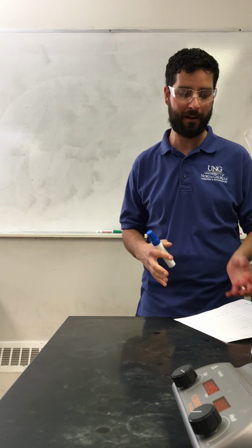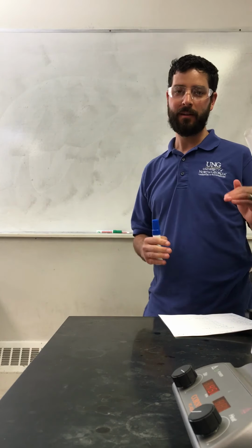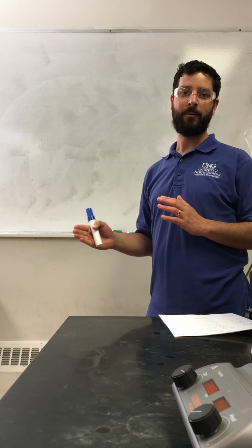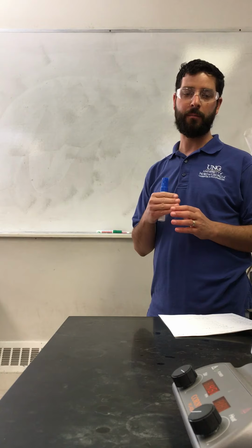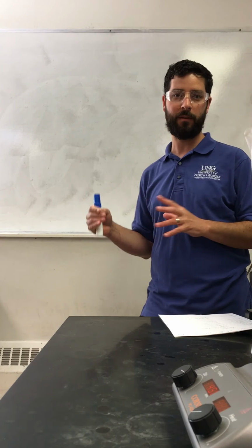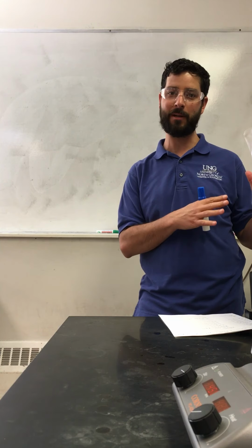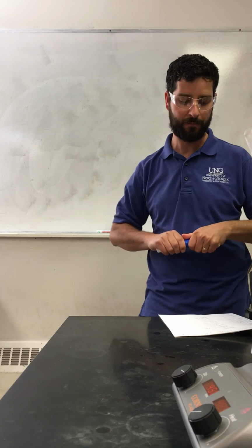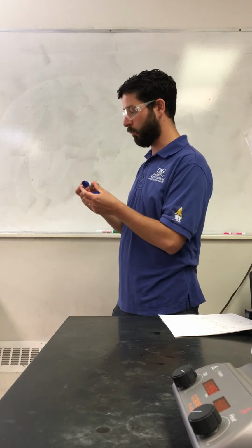So we've collected our data now, and we have 7 temperature and volume measurements, and we have 1 temperature and volume measurement for the cold. We're going to separate the cold and treat it separately from the other 7. So the 7 hot measurements are what we're actually going to plot, and we're going to use the cold one to do a calculation.